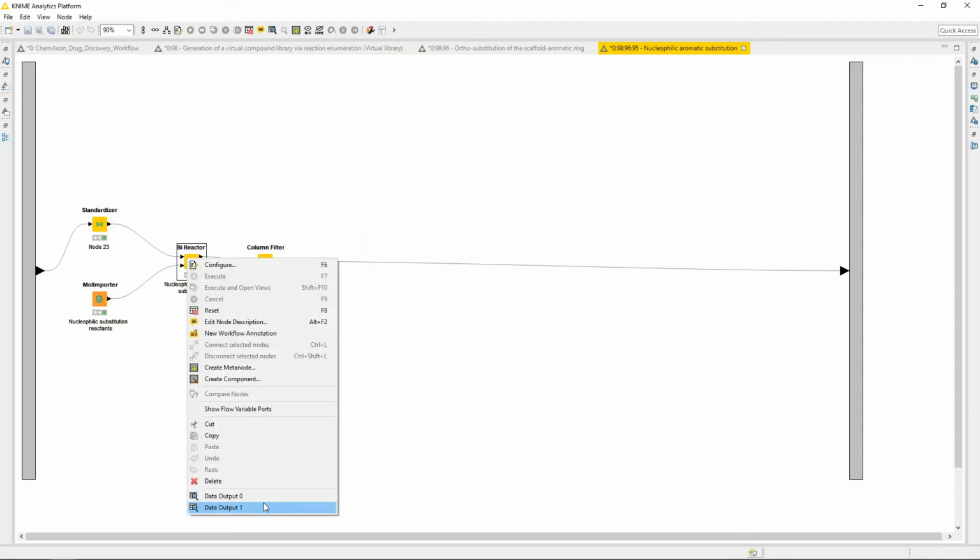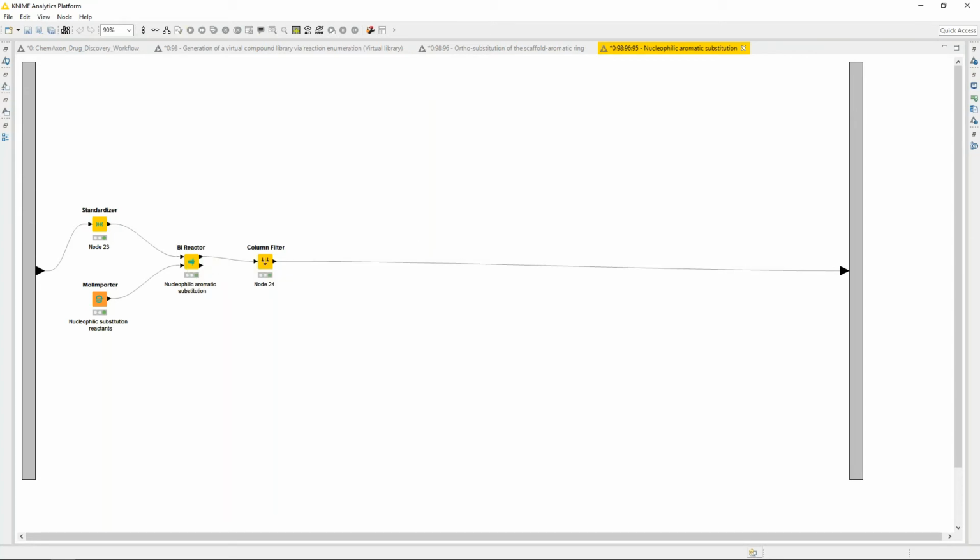Okay. Surya, 1 minute. How many reactions? Currently, I think you have given 3 sample reactions. How many ready-made reactions do you have already? Oh, sorry, I didn't get the question. How many sample reactions do you have, or otherwise, how many MRV files do you have? Currently, I think you have given only 3 MRV files. One is Friedel-Crafts acylation, the other one is this nucleophilic substitution, and one more.